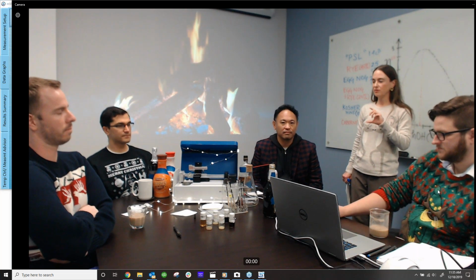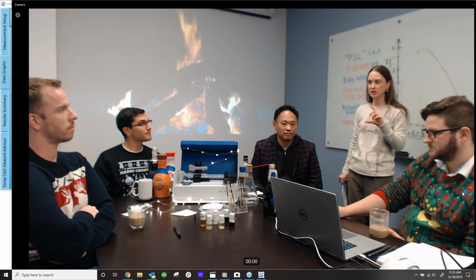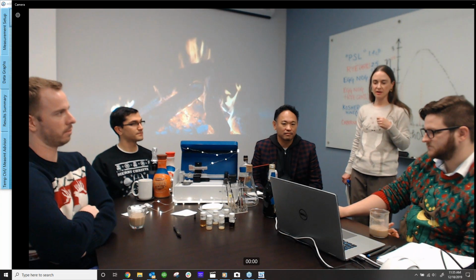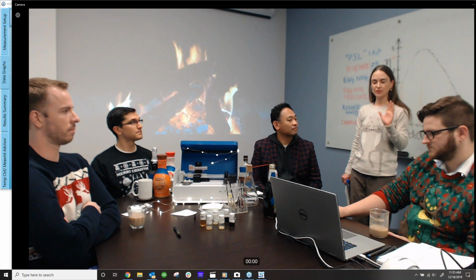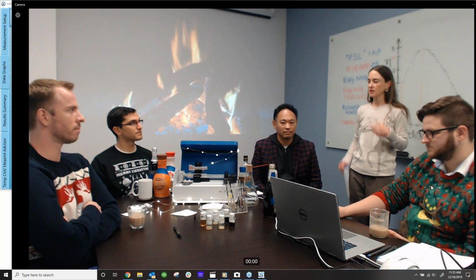So we have flow channels ranging from 20 microns up to 300 microns. So if you have different needs in that respect, then you can handle that. But yeah, 10% or less of the channel depth. And we do have a range of channel depth depending on your needs.